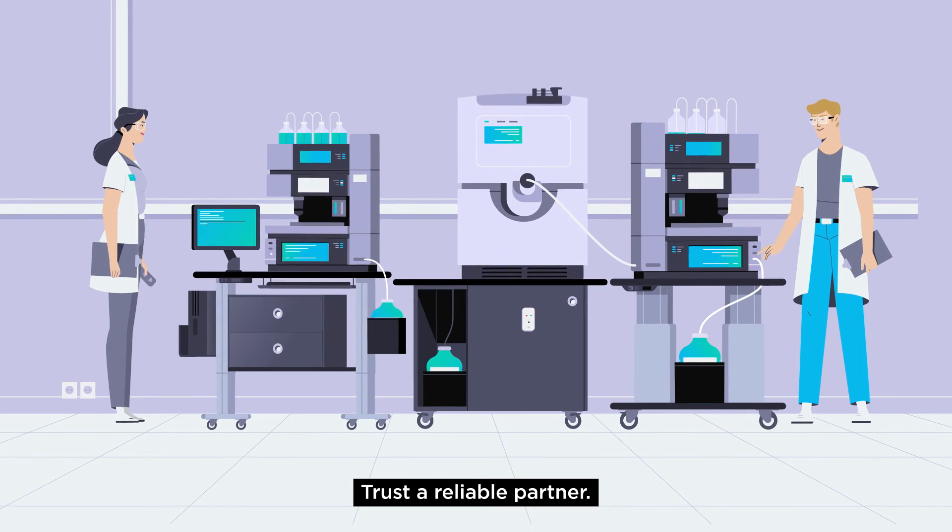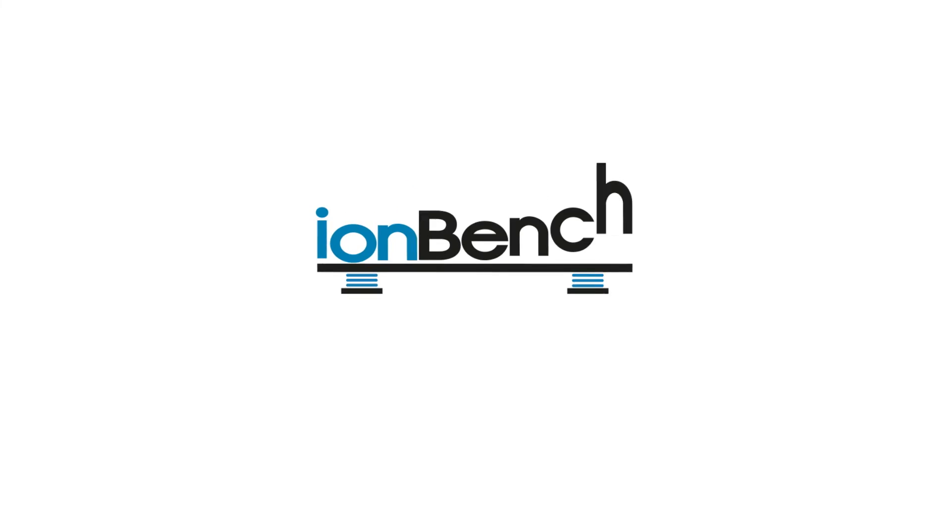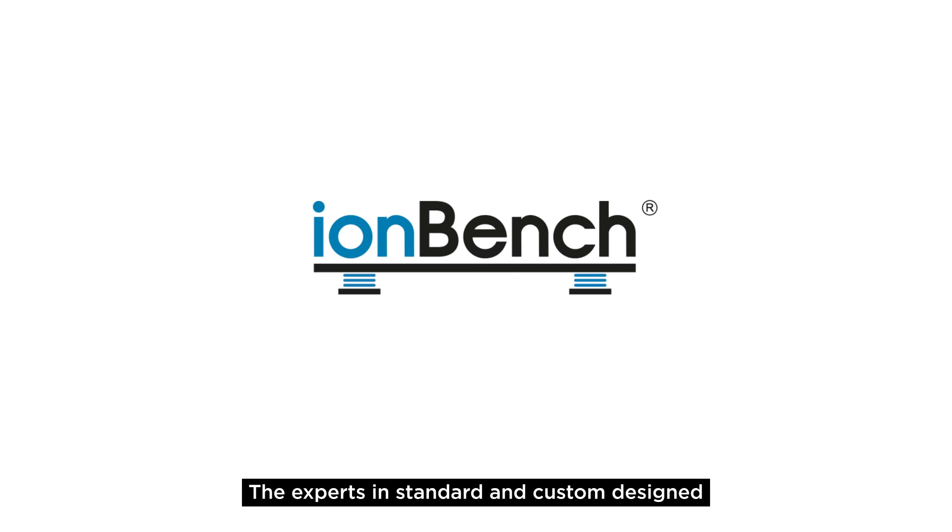Trust a reliable partner. IONBench, the experts in standard and custom designed LC and MS laboratory furniture.